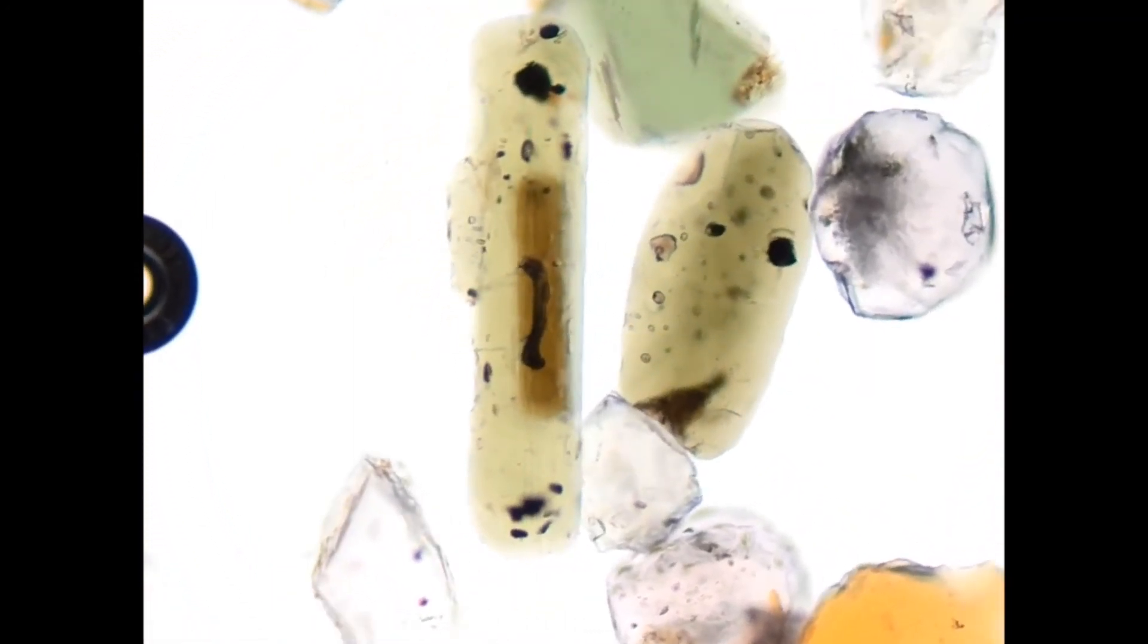If we look at the minerals under cross-polarized light, we see second to third order interference colors, although they are obscured a bit by the strong own color of the minerals.